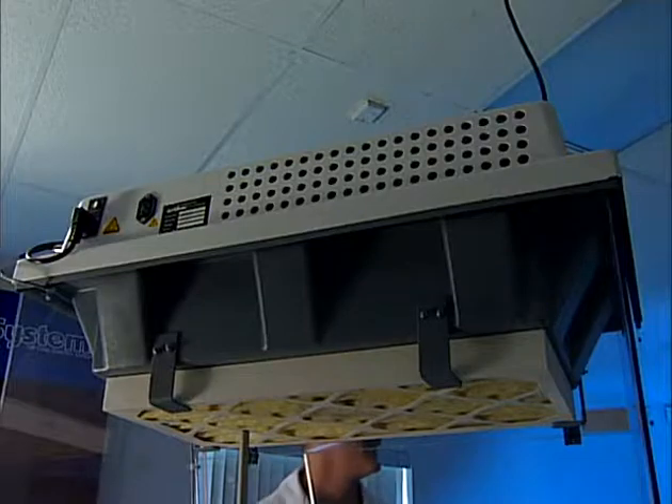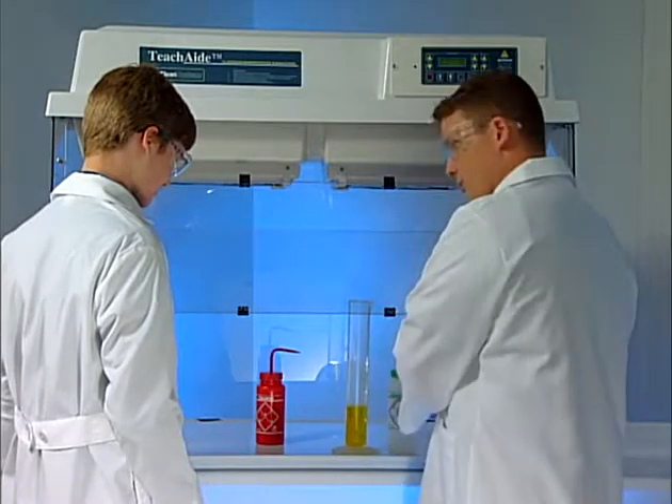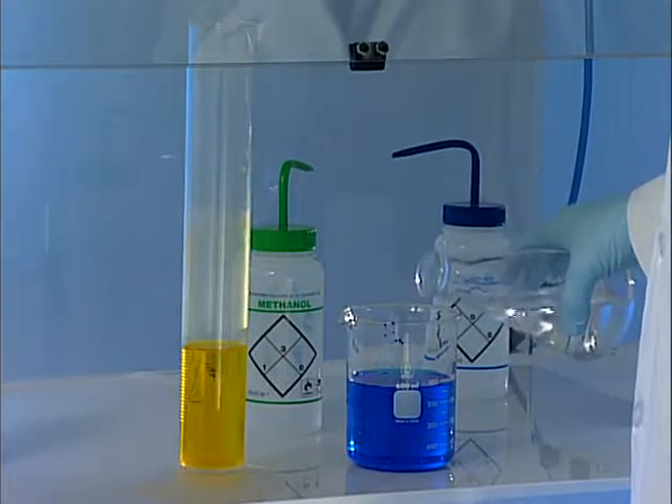The TeachAid filtration is designed to capture particulate and absorb or neutralize common chemical fumes and vapors associated with classroom demonstrations. TeachAid ductless classroom demonstration workstation is used in many science disciplines, ranging from middle school to graduate level courses. Advanced safety monitoring of airflow and filtration makes TeachAid the right choice.